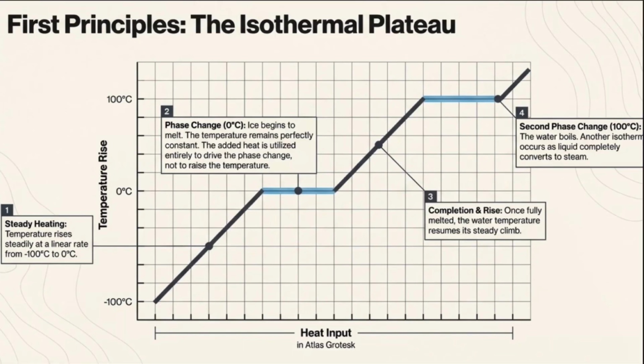The title of this slide is the isothermal plateau. Here there is a rising graph, and what this graph shows is that, for example, we are melting ice.